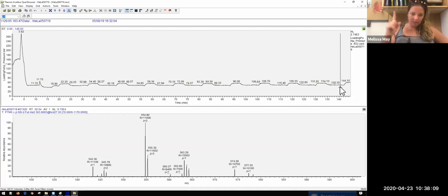If you were to see big spikes and drops, that means that something happened. So you could have signal fallout, you could have a clog coming through. And so if you're not getting good data, this could be a good place to go and kind of start troubleshooting what the actual problem is.